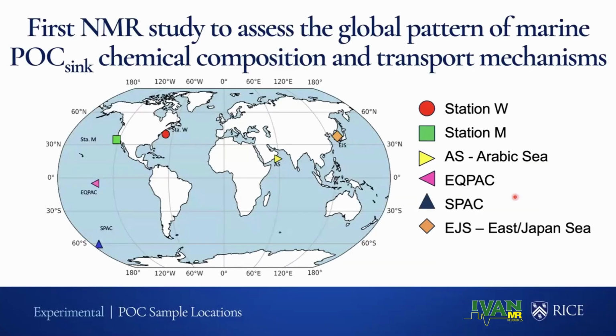Okay, we received time series sinking POC samples at various sites across the globe from our collaborators, including Station W, which is located in the Northwest Atlantic. Station W is one of the longest and oldest sediment trap studies, led by Woods Hole scientists who are really the pioneers in the field.